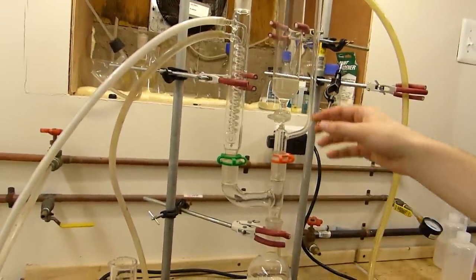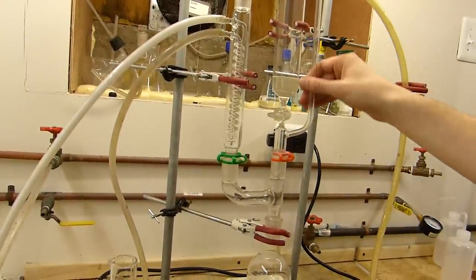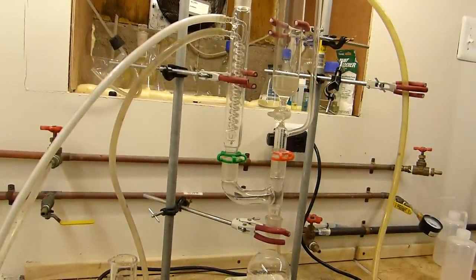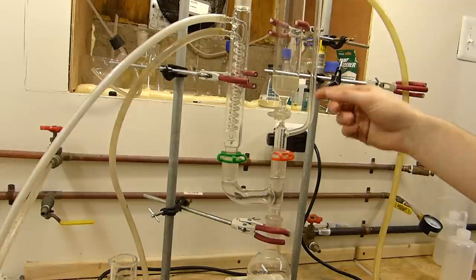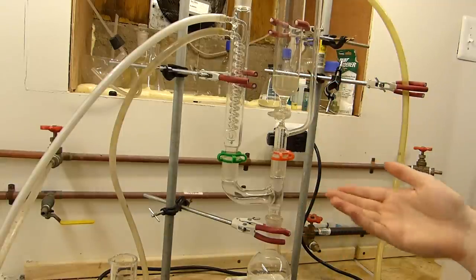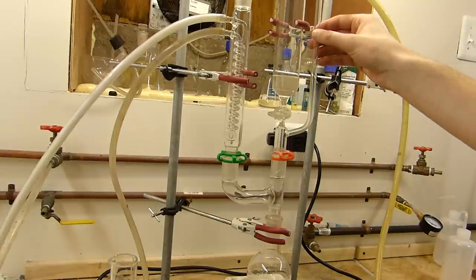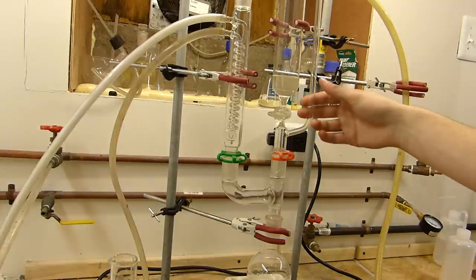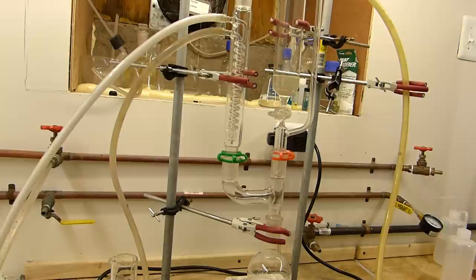In the other socket on the Claisen adapter, we have, in this case, a 250 milliliter pressure equalizing addition funnel. Now, it's important that it's pressure equalizing, because otherwise, you won't be able to drip the ammonium sulfate solution nearly as effectively, which will give rise to erratic ammonia evolution, and that's very bad for a number of reasons that I'll get into after this thing gets going.